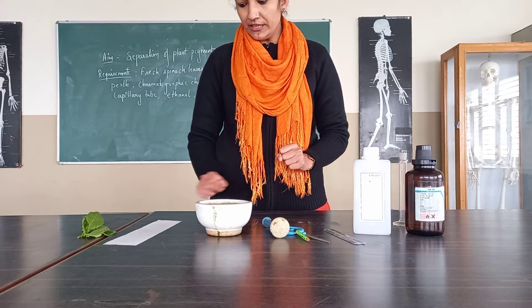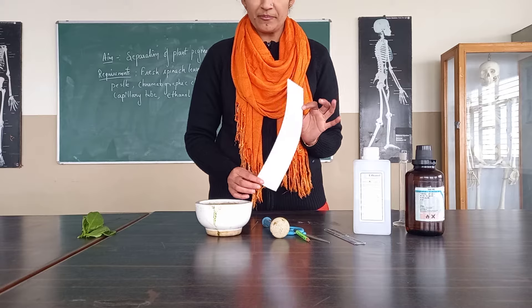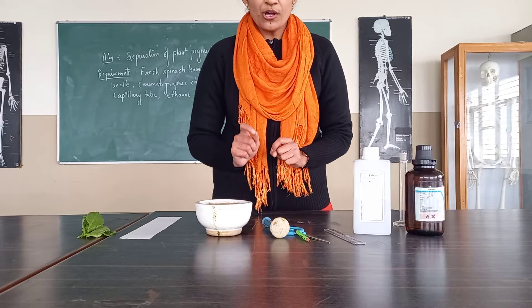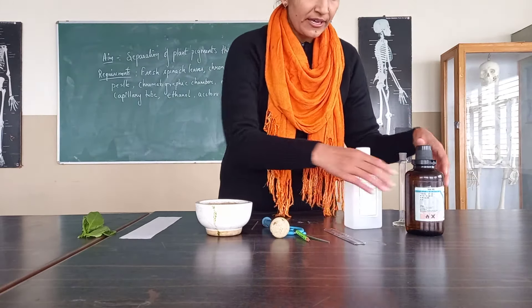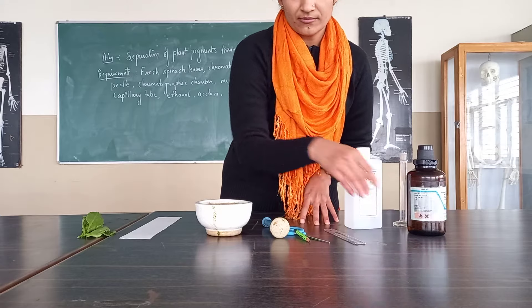So for that, what we need: we need the chromatography paper — Whatman paper number 1. This is the chromatography paper. Afterwards we need the solvent, which should be organic in nature. We can use ethanol, we can use acetone, and we can use a mixture of them also.